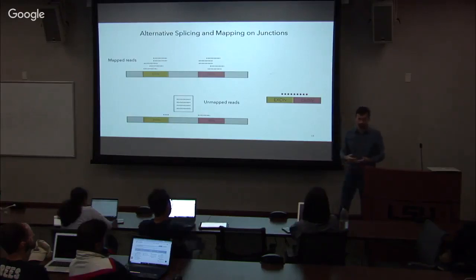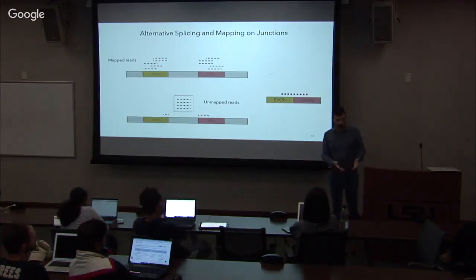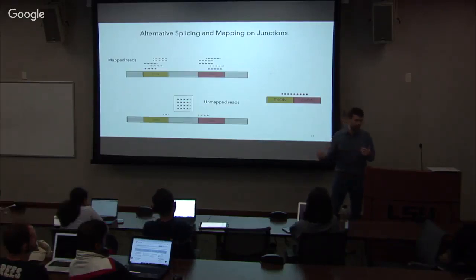So these reads represent what we have in our sample, and what we map to is the reference genome. So that would be the FASTA file of the human genome, for example. That make sense?